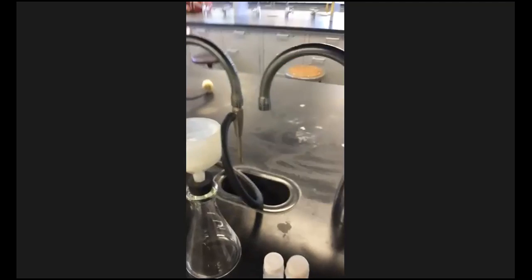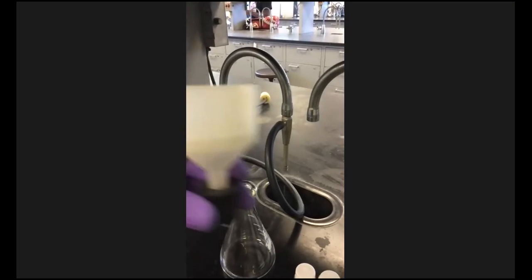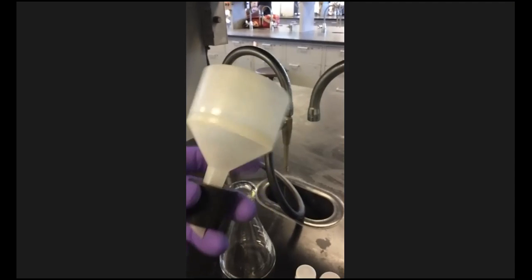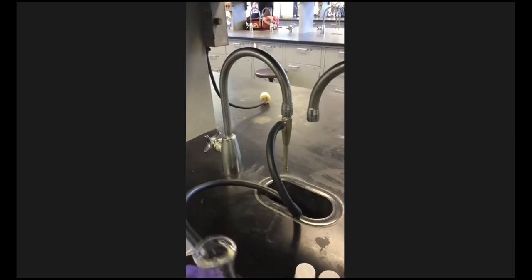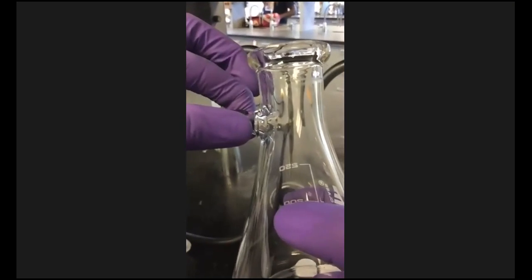So while that's heating, I'm gonna show you the vacuum filtration part. So over here, you have what's called a vacuum filtration setup. You have a Buchner funnel, which is here, this little conical plastic funnel. And then you also have on that a stopper. And that goes into a vacuum flask, which is right here, right? It's called a vacuum flask because it's got a little nipple on the side where you hook up a vacuum hose to it.